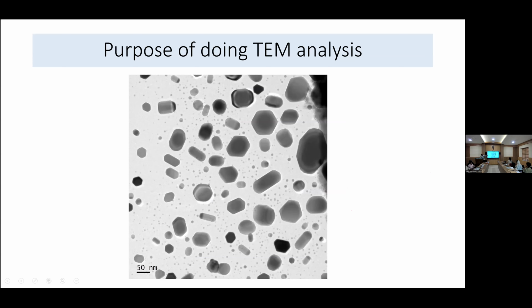So what are the things you can identify? Because there are a lot of things here, like very small particles, a well distributed dispersion, and different morphologies and sizes. So in this image, you can identify many things. This is not a good sample, but it is good for explaining why we use this technique, because there are different morphologies, different sizes, everything. In this part, we can maybe show this agglomeration. To identify all those things in your sample, you go for TEM. This is why we use the TEM technique: to identify the size distribution, aggregation, agglomeration, morphology, all those things.